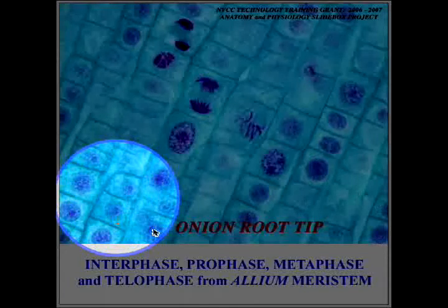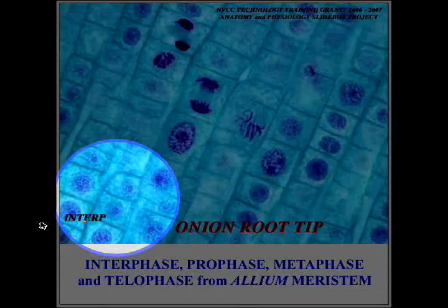Now what I'd like to do is find out if I can possibly type that in over here. So we're going to take our little cursor over here and go INTR. And that seems to work actually. So we'll put this over here. These are interphase cells.